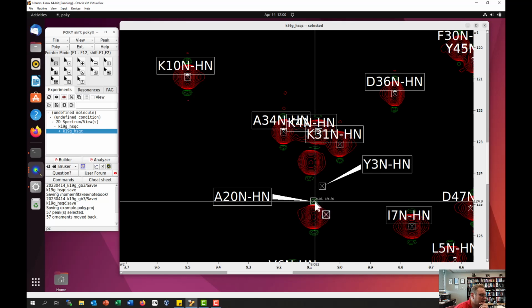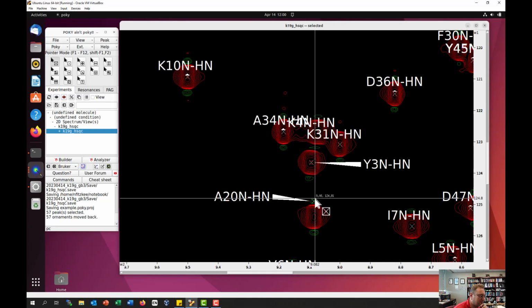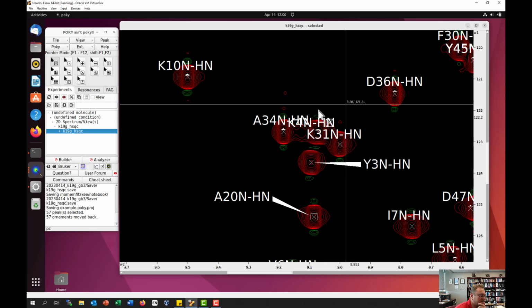And A20 is now centered on one of these sync artifacts. Easy enough to fix. I can drag that up here, and again, just type PC, and it'll center all those selected peaks. And I can drag this one, if I click off and then drag this one close, and then select that peak and do PC. Now it'll be the same.